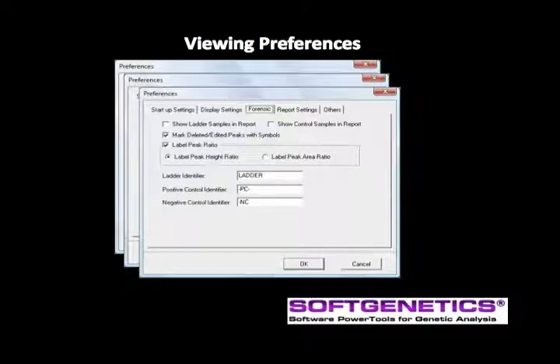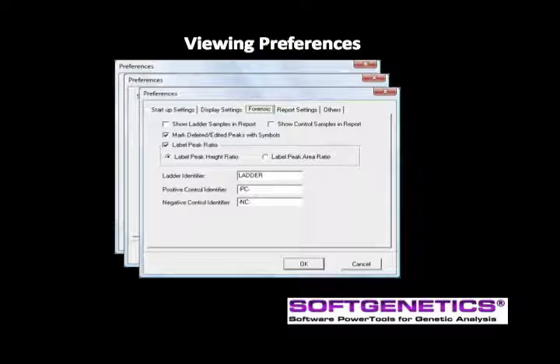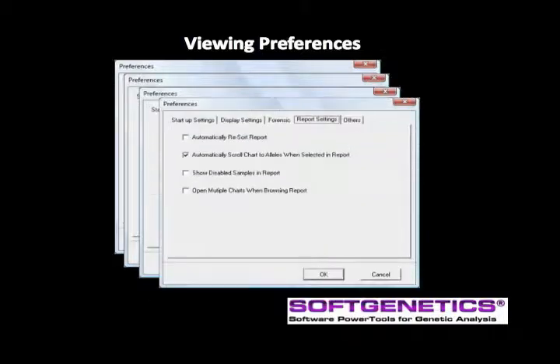The forensic tab includes options to show ladder and control samples in the report table, to mark deleted or edited peaks with a symbol above the peak in the trace — E for edited or X if the peak was deleted — to calculate peak ratios by height or area, and the naming conventions for recognition of ladder and control samples as discussed earlier in this webinar.